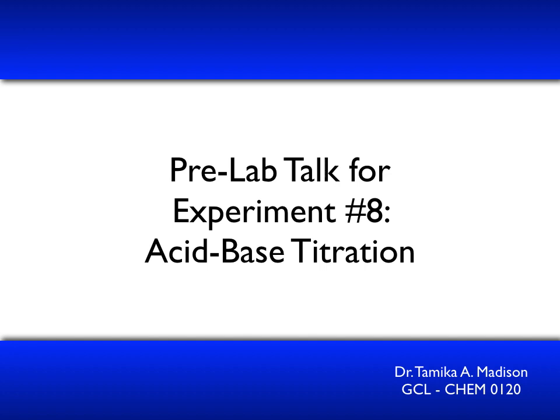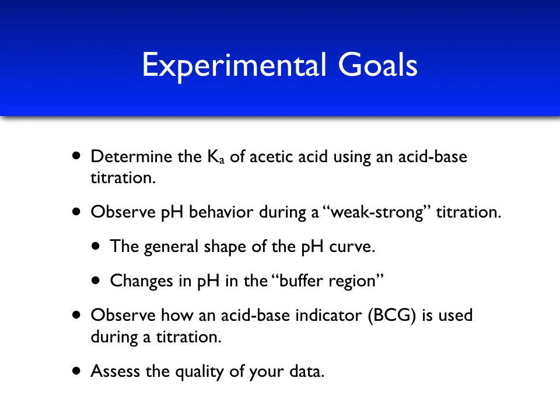This is the pre-lab talk for experiment number 8 for Chem 120, the acid-base titration. The goals for this experiment are to determine the acid ionization constant, or Ka, for acetic acid using a titration.